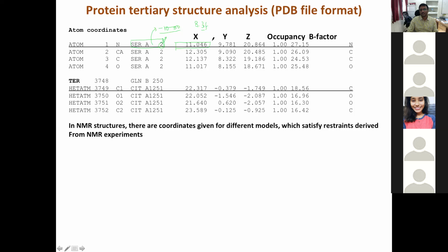So this is the format which is given, and then the XYZ coordinate which is given for every single atom, and that's what you are interested in. This is the positional coordinate with respect to some 0, 0. I can have 2 protein structures lying in the same space. Then there is a factor which comes quite often, called the occupancy factor, and then the B factor.